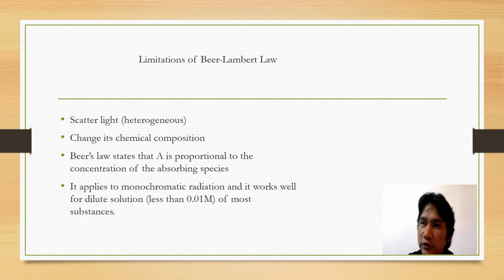Other limitations of Beer-Lambert's law: avoid scattering of light. And as much as possible, the chemical composition is constant. The chemical composition of the sample in the cuvette does not change.